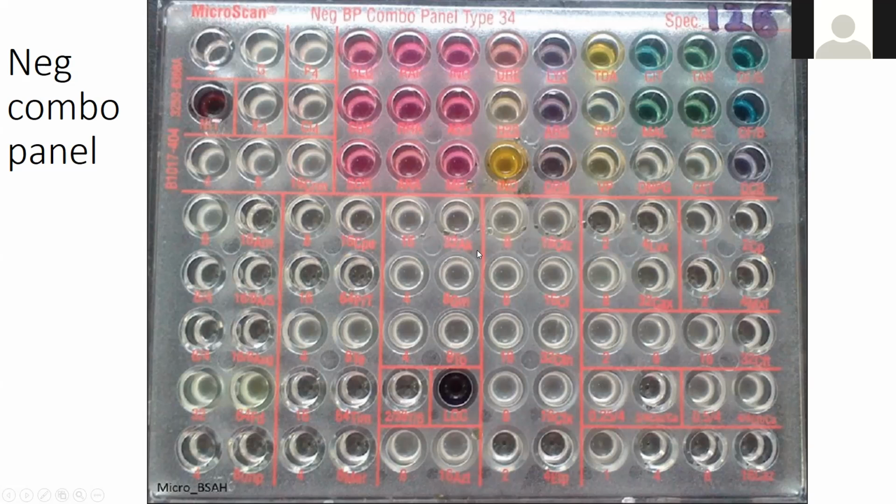And then you have your antibiotic sensitivity. So you are going to read this today. So be ready for that if you had a negative panel and set up that smelly, bleach smelling thing. It's still smelling down there. Even y'all's panels are smelling.